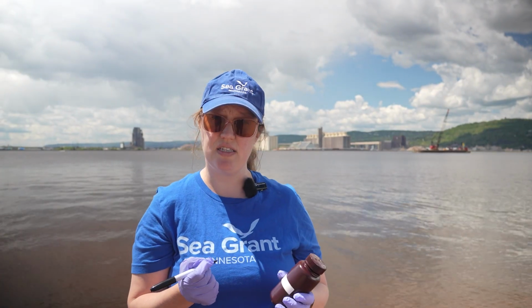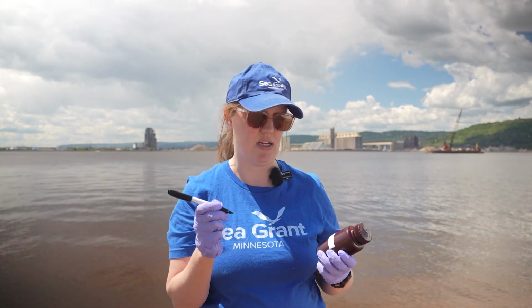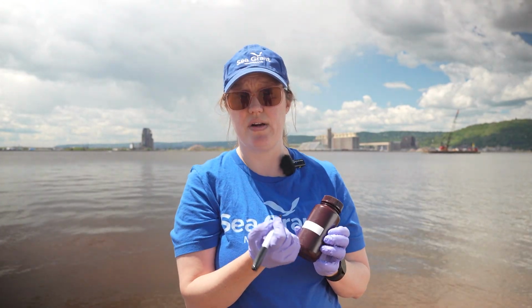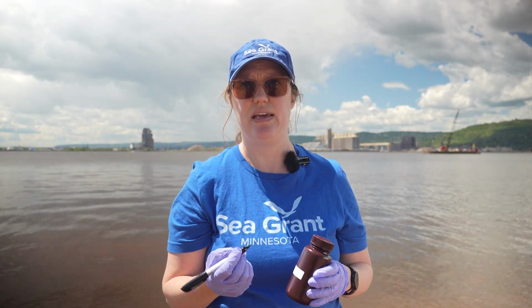So once you've collected your water sample, you will want to label the bottle, and we've provided a Sharpie in each sampling kit. So all you need to put on the label is your name, the name of your lake, and the date the sample was taken, just so we can match it with the data sheet later.